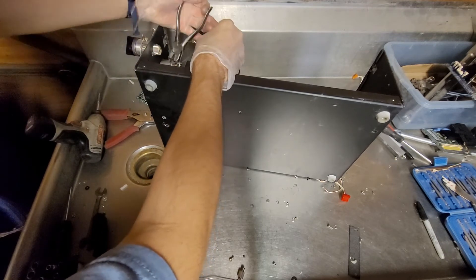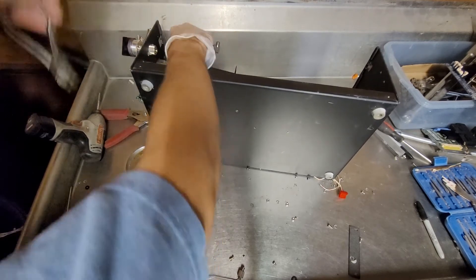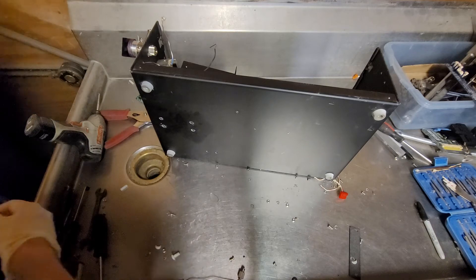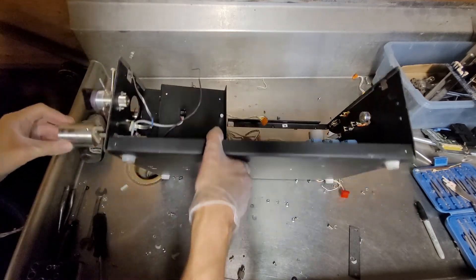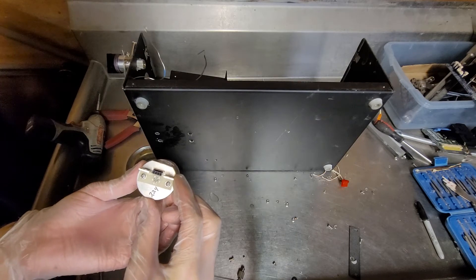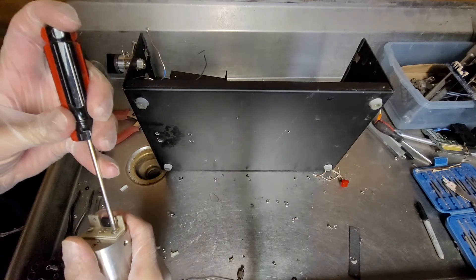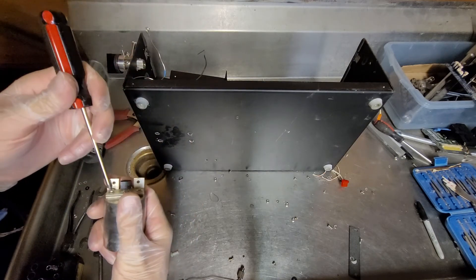I couldn't even find any manuals on this thing, so that was kind of annoying. Another stainless steel line. I don't understand how this works — it's a ginormous piece of stainless steel, at least for whatever it does.